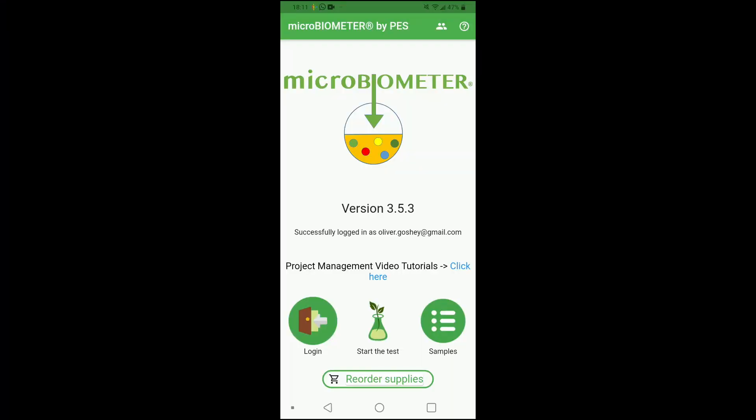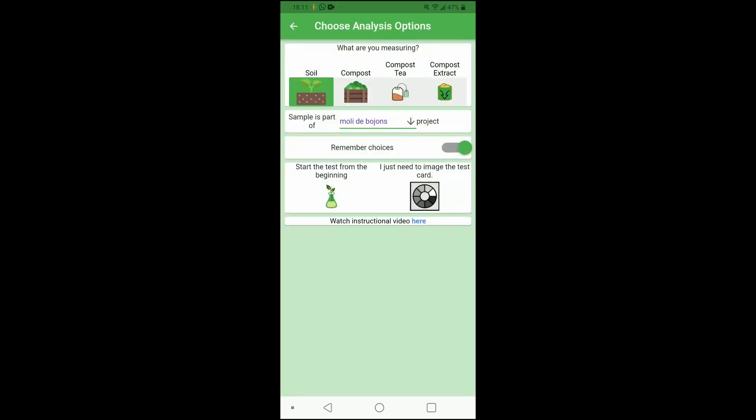Here we are on the home screen for the Microbiometer app — it's very simple to get started. All you've got to do is press the button in the middle: start the test. It gives you the option to start from the beginning, which walks you through all of the steps, including a great video that guides you through the whole process. But seeing as we've already done that, I'm just going to click on the button that says 'I just need to image the test card.'